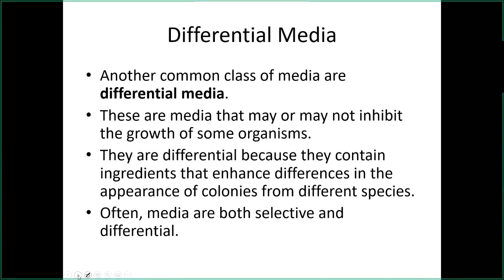So if you weren't fully clear on what differential media were previously, now you should be. These are media that, let's say you have 15 different organisms in a mixed culture, and you plate them out on the differential medium. You'll still grow 15 organisms, but you'll see major differences in them that are brought out by constituents, that is, ingredients of the media that you're using. So that's generally what you're going to expect with them.